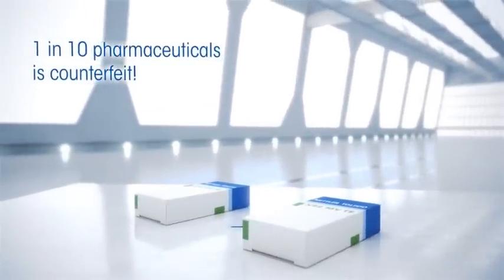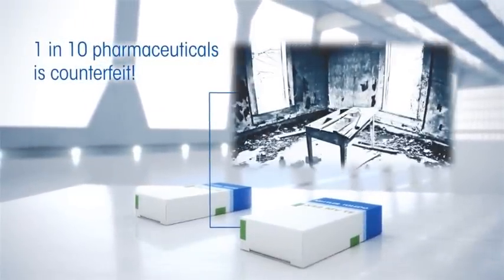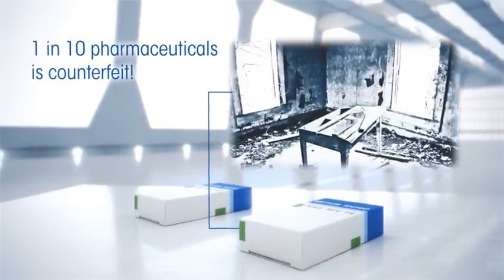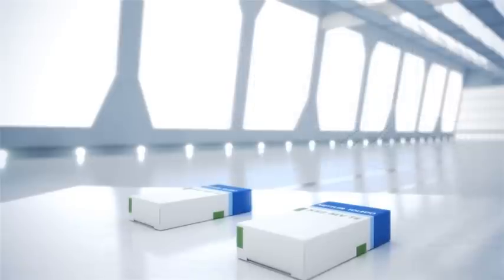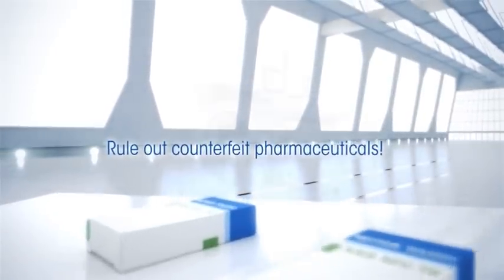One in ten pharmaceuticals is counterfeit. Illegally produced medicines are dangerous for your customers and your brand. Rule out counterfeit pharmaceuticals with the XS2 MVTE.